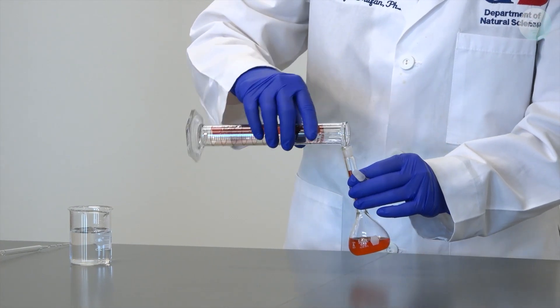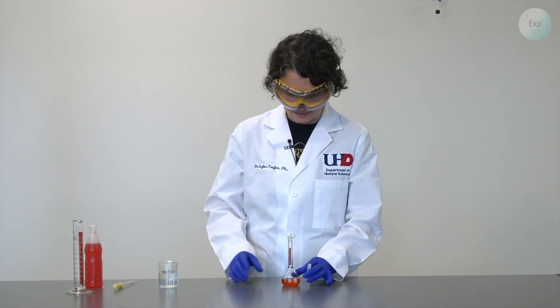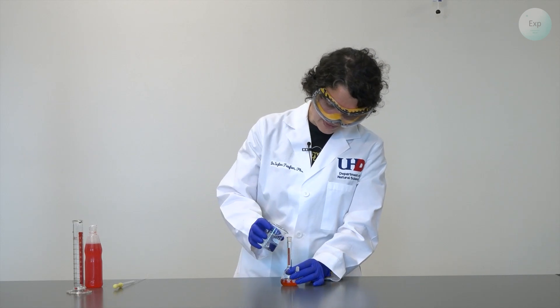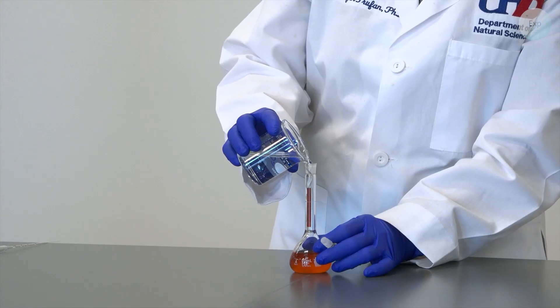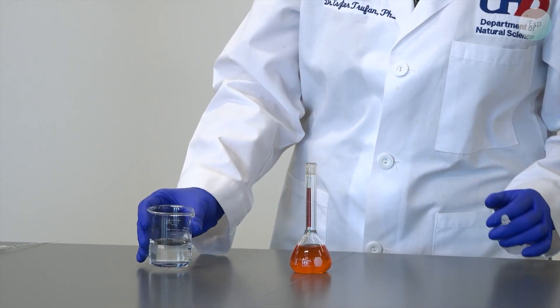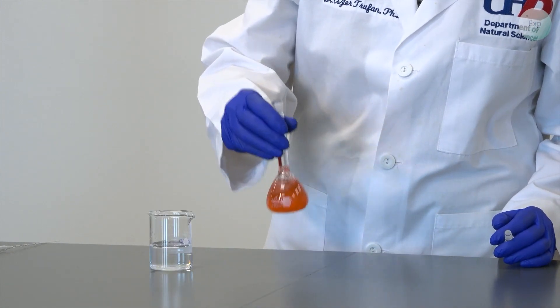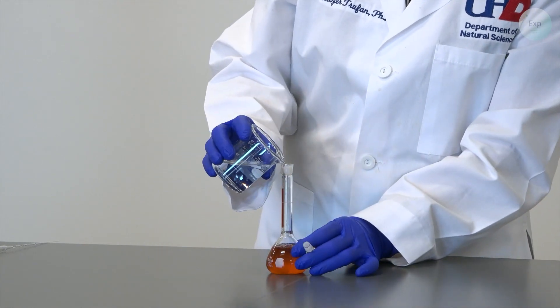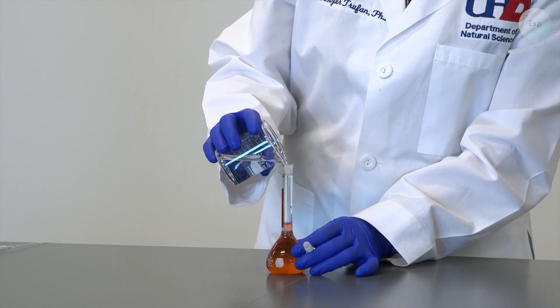And when our rinsing solution turns very clear that is a good sign for us that we are done with the rinsing. And for the rest we're simply going to add water into our volumetric flask. We occasionally swirl. And then we make sure to add enough water to get to the mark.